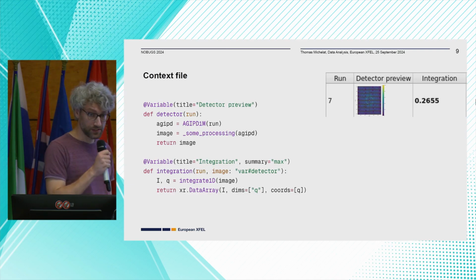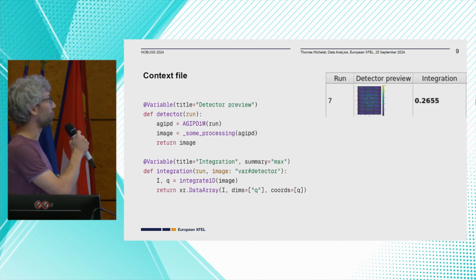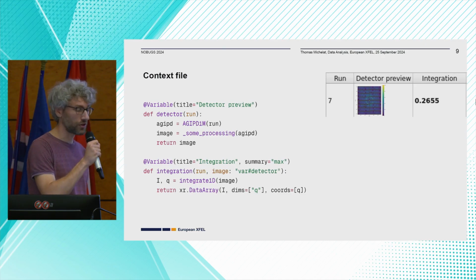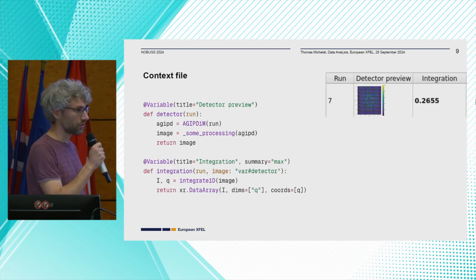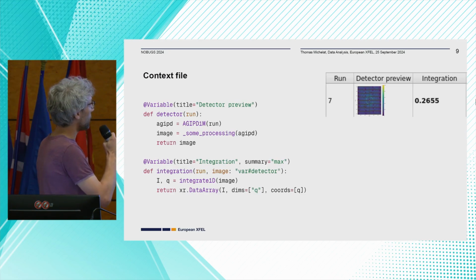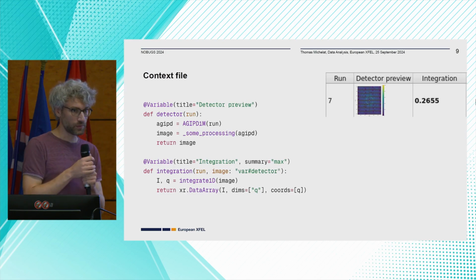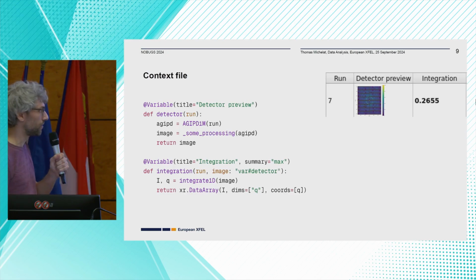I didn't ask for a workshop session, but here's a very express crash course on how you could write such code to generate those tables. It's basically a Python file that you need to write. We try to make it as simple as possible, so any user who comes for the first time would be able to add any quantity they want to monitor.